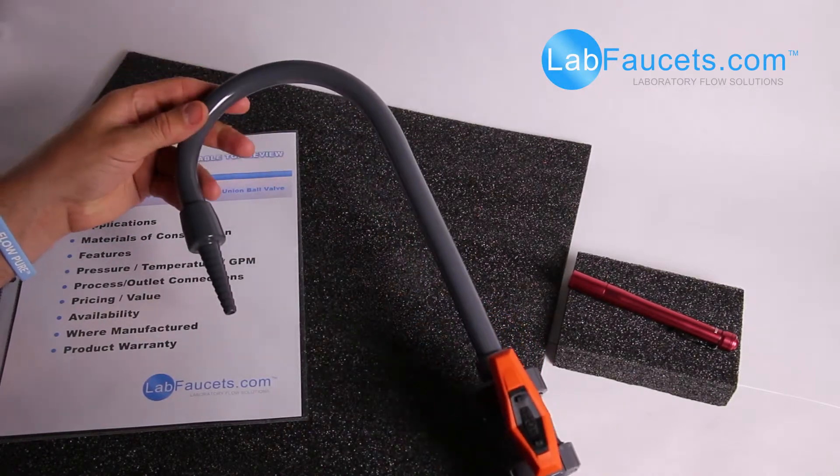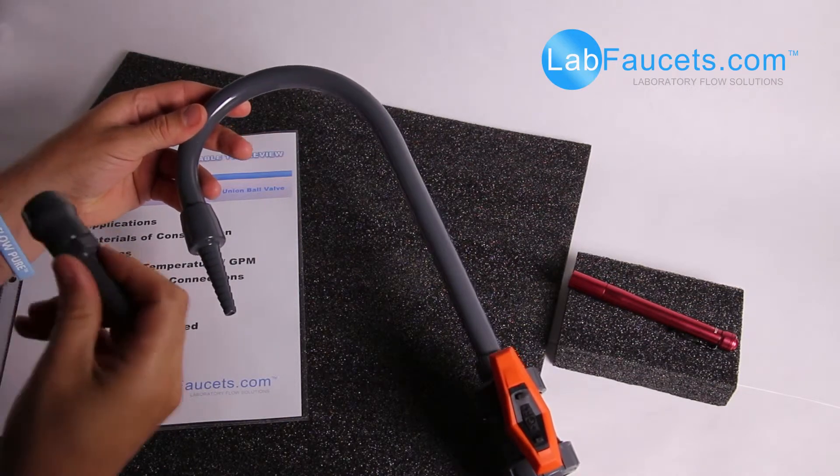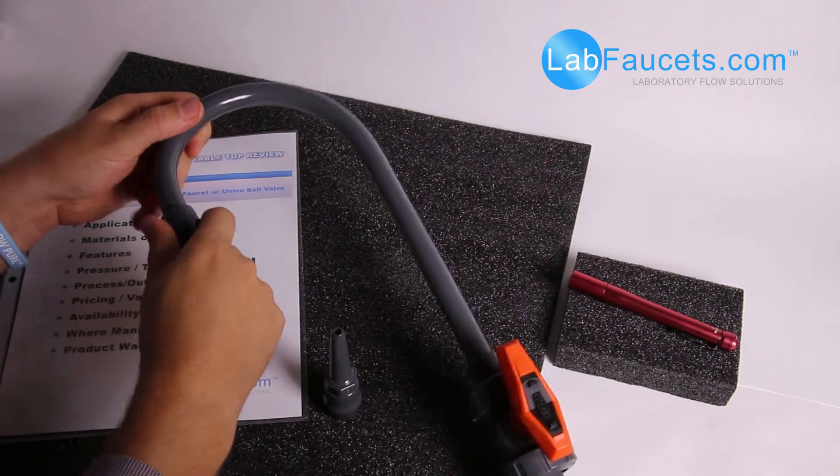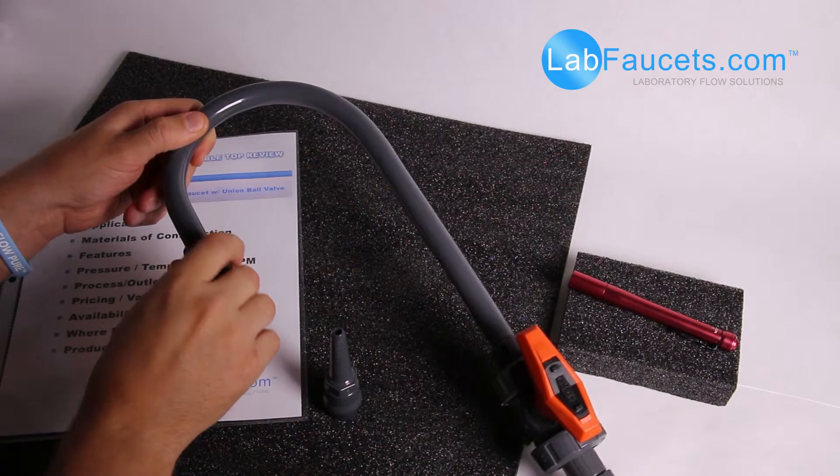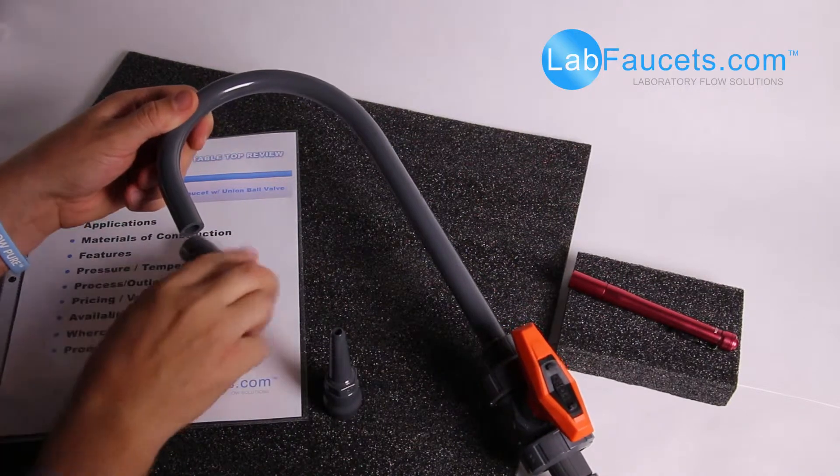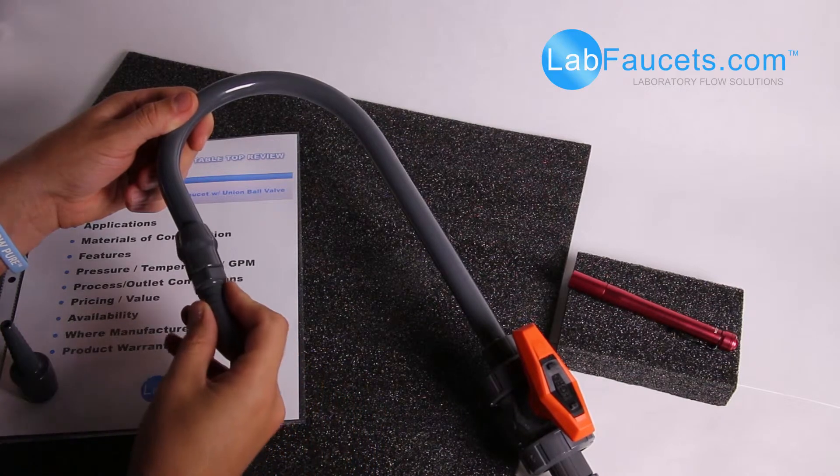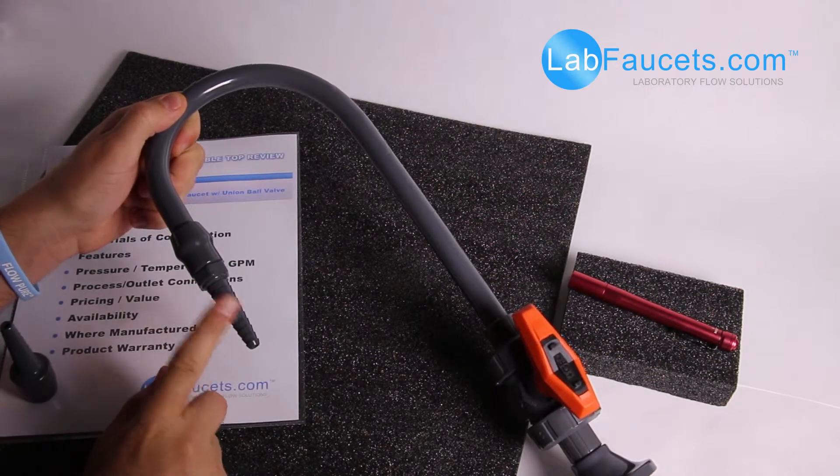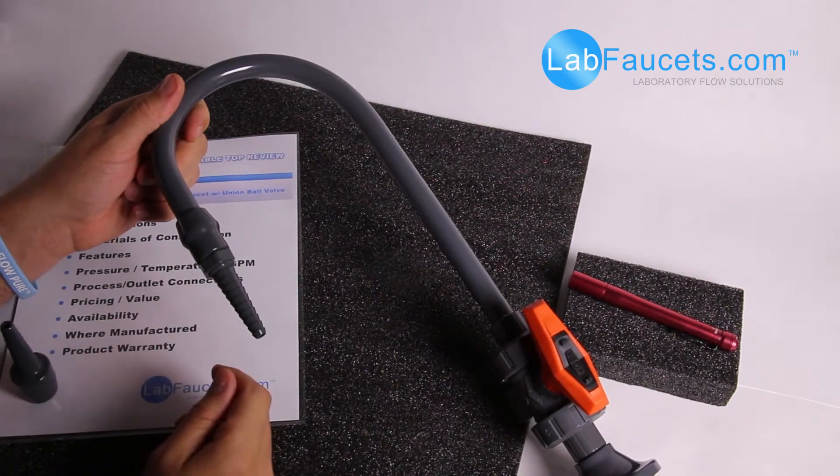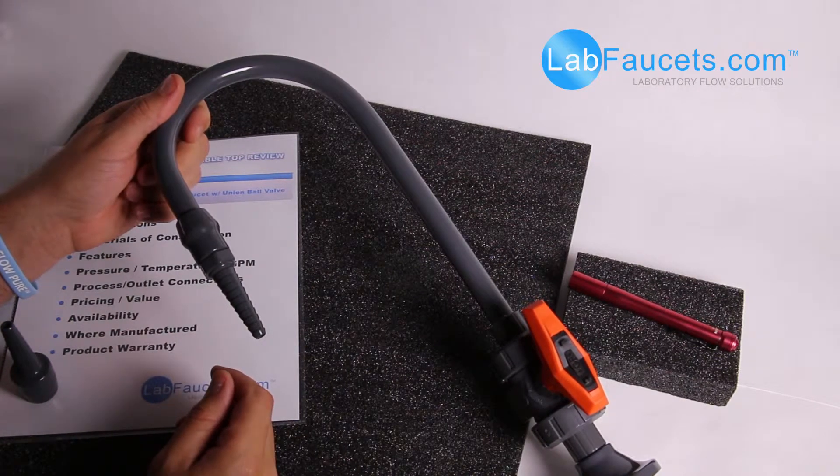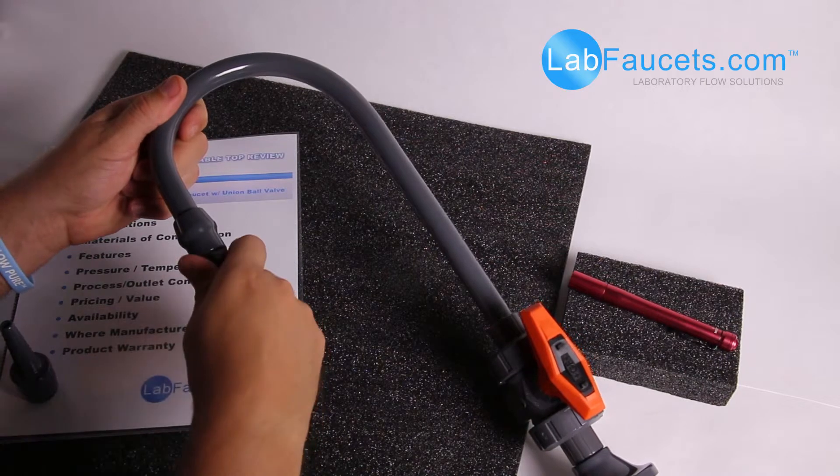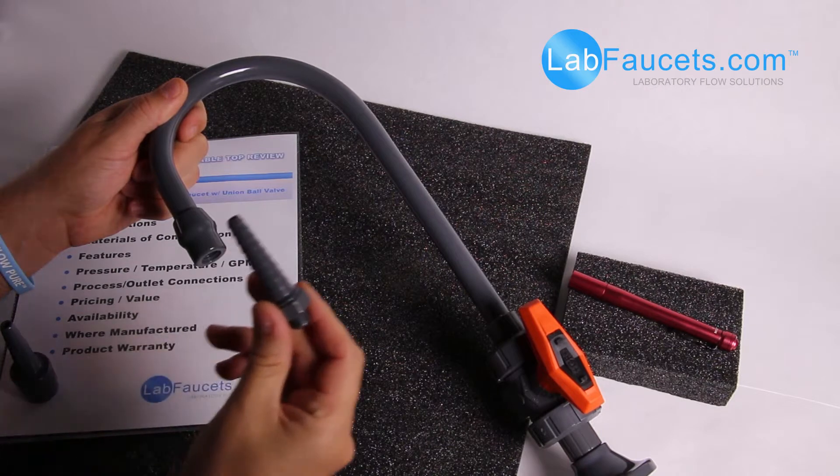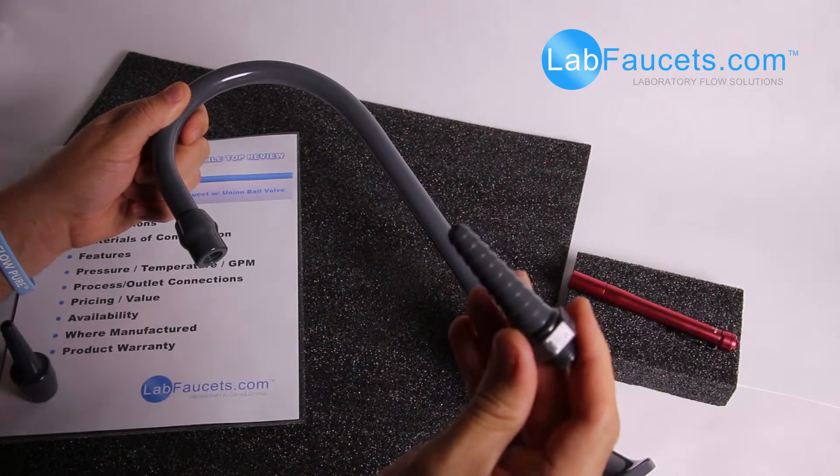This faucet can also be purchased with a removable barb tip. And for illustration purposes, I have a unit here that is not solvent welded to show you. This adapter fitting here provides an injection molded removable PVC barb tip. This barb tip is also serrated and also accepts quarter-inch through half-inch ID tubing.